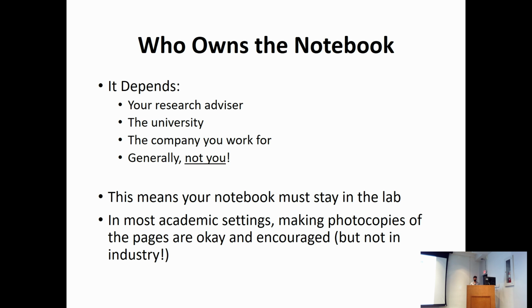Okay, from this part: who really owns the lab notebook? All of us are coming from an academic environment, so all are working under a PI or an academic advisor, which means he or she is the one who owns the lab notebook. So it should always stay in the lab, and you can ask for permission if you want to get photocopies or take pictures.